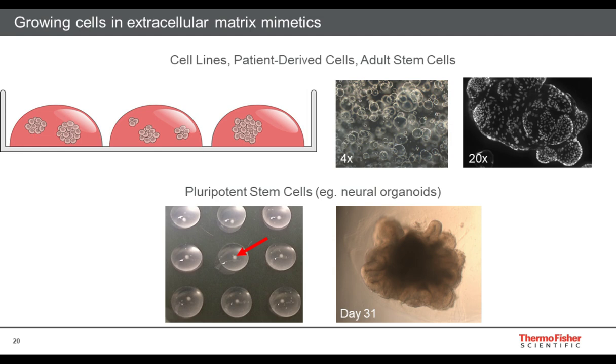One other thing that's important to point out is that these materials are also quite viscous, and so in order to pipette accurately with these materials, it's definitely a good idea to work with positive displacement pipettes instead of the air displacement pipettes, which are probably a little more standard in most cell biology or molecular biology labs. It certainly pays dividends in pipetting the exact same volume from droplet to droplet, which can impact how these things are being fed.